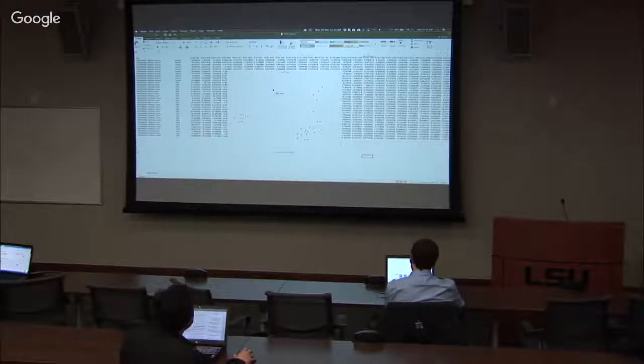You mentioned before, even if we transform the data, or we normalize the data, or we use the raw data, the PCA should not differ so much, right? Well, the difference between normal and DCIS should be more significant than the difference between one group of DCIS and another group of DCIS, like we saw in the previous one, right?